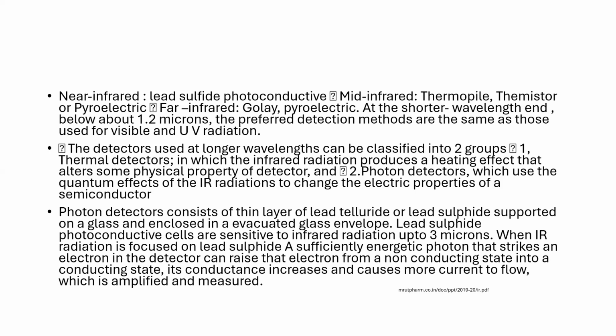It is allowing the collection of the signal generated. If it is a strong signal, it can be identified directly, or it is multiplied using multiplier systems like the photomultiplier in UV visible, and then it will be detected and recorded. If required, it will be amplified, and then measured.